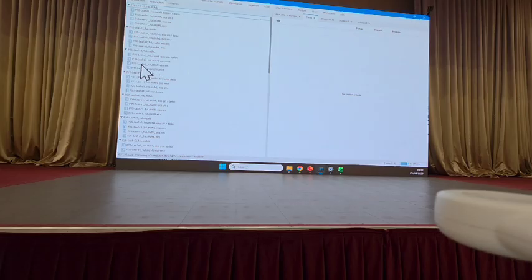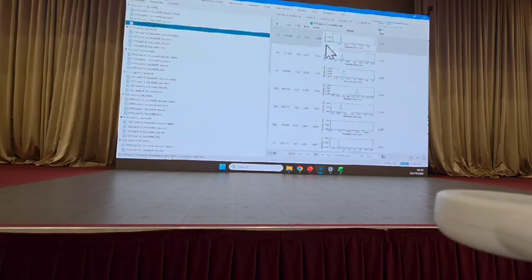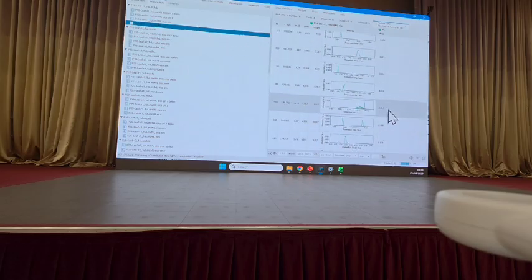An XIC is just the tracing of a given m/z over a retention time. And we can't create an XIC manually, by hand. It would be very exhausting. So what we did was we first built an XIC for each sample. We smoothed the XIC. We split the XIC.